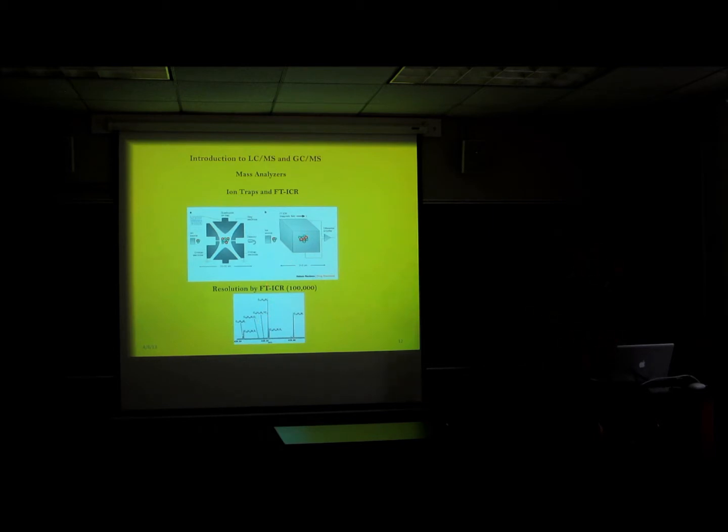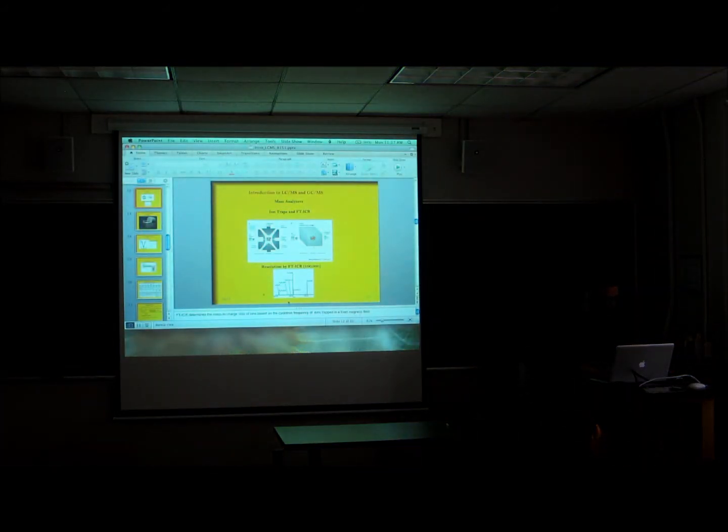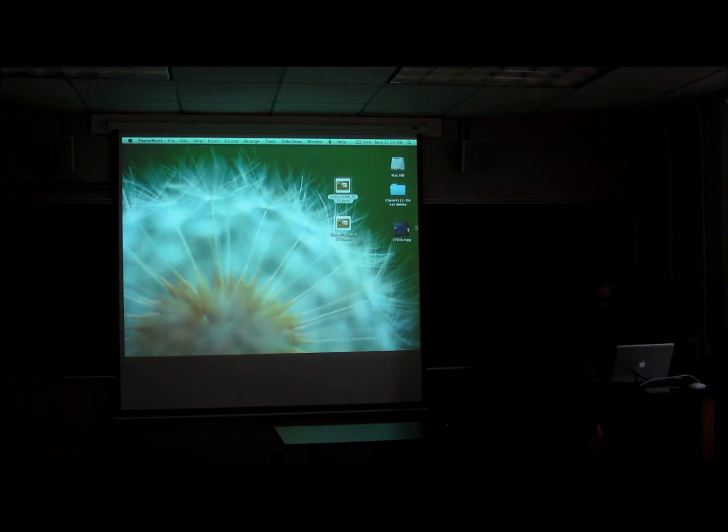I have a movie of FTICR, which we'll watch, to give you a better picture of how this works.